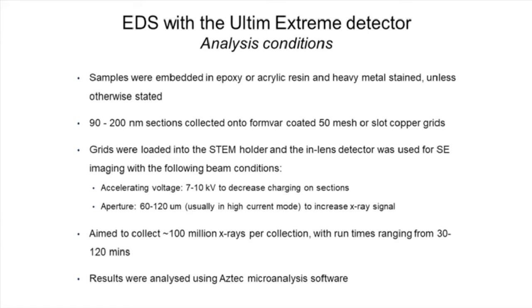For most scans, we're going with a high dose to increase the X-ray signal, aiming to collect around 100 million X-rays per run, with run times ranging from 30 minutes to 2 hours.